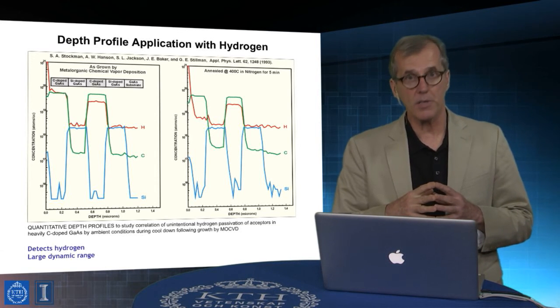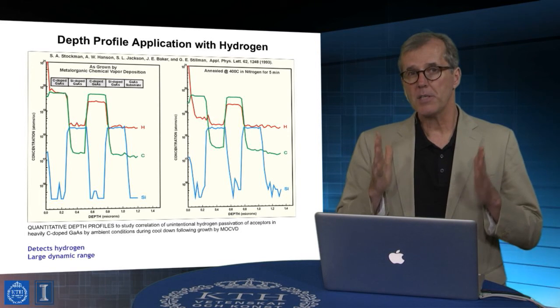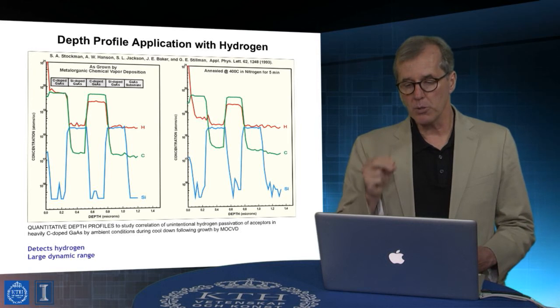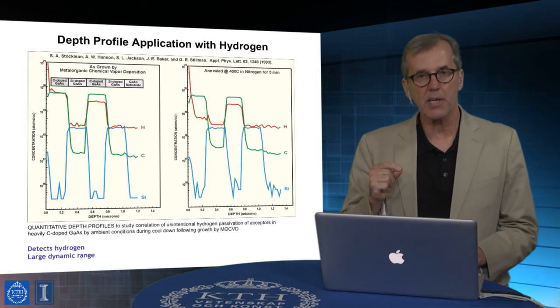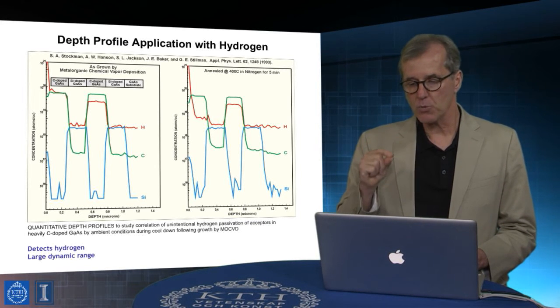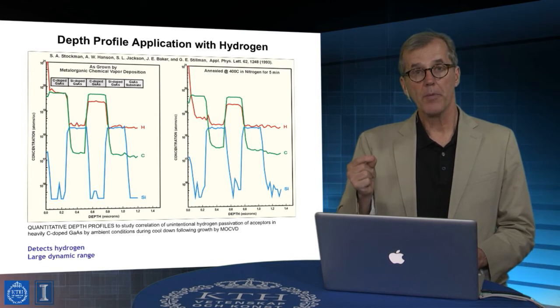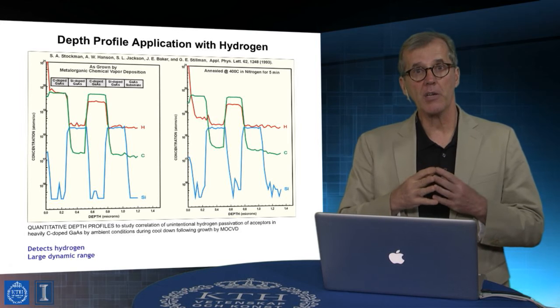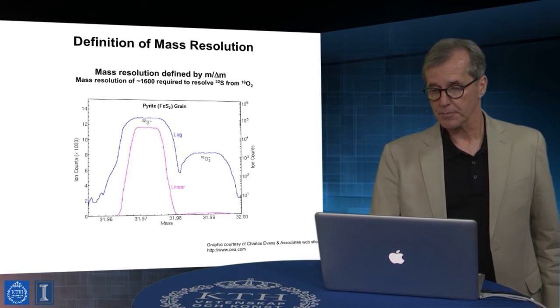of 400 degrees Celsius. So this would be a very hard piece of information to get, how a dilute silicon component, right? This is like really small numbers of silicon atoms per cubic centimeter, actually being measured with very high sensitivity, and its spatial distributions being changed as a consequence of thermal processing.